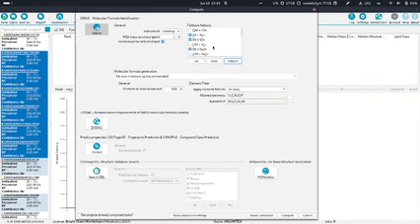And then there's this enforce button, which basically says overwrite the adducts. Or not overwrite, more like add these things no matter if there's already an annotation. That's used when you say, I don't totally trust the annotation which is already in there. Let's say I process data with MZmine, and it annotates them as M plus H, but I have the feeling it could also be M plus potassium, maybe there's something wrong. Then I can click on this enforce button, and it would add these to the candidate list.